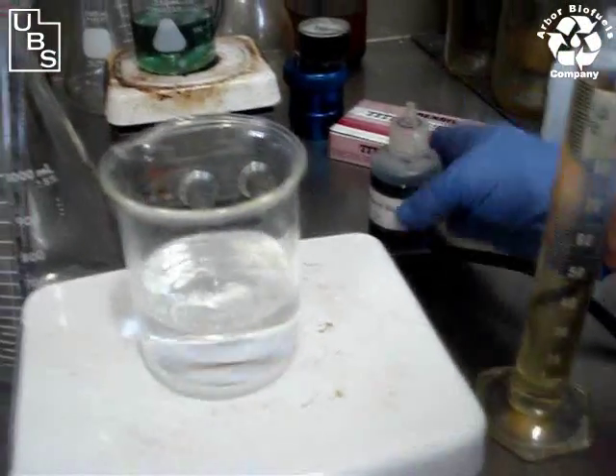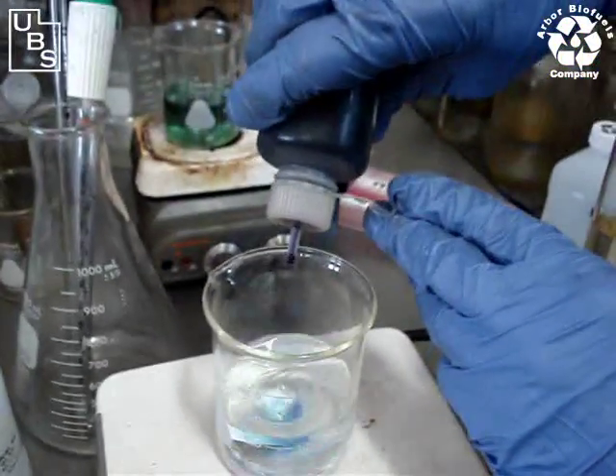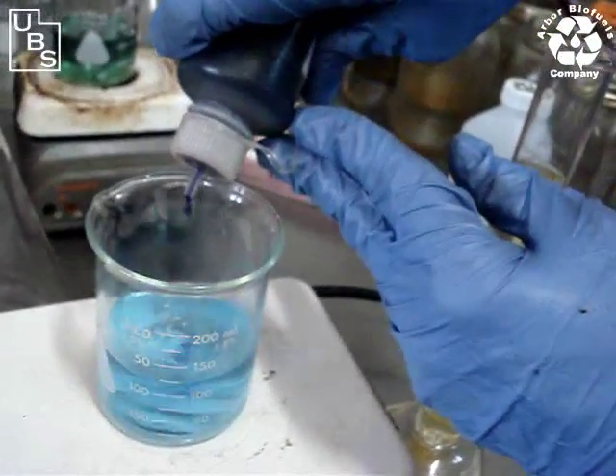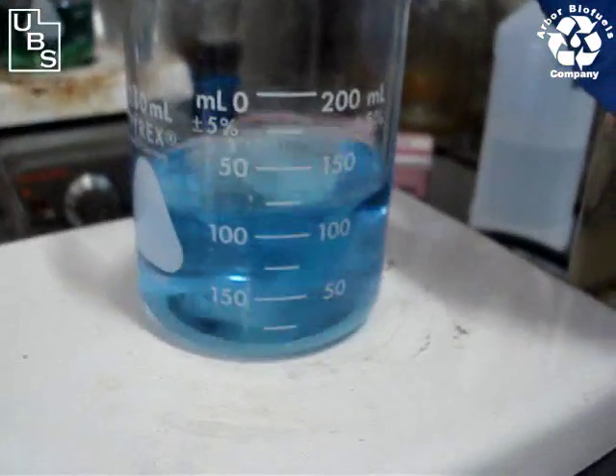We're going to add the bromophenol blue. We have a nice little dispenser here — it puts it out a few drops at a time. We like to color it to our own liking, so we just keep adding it until we get a nice dark blue. I'll just keep adding a few drops here.